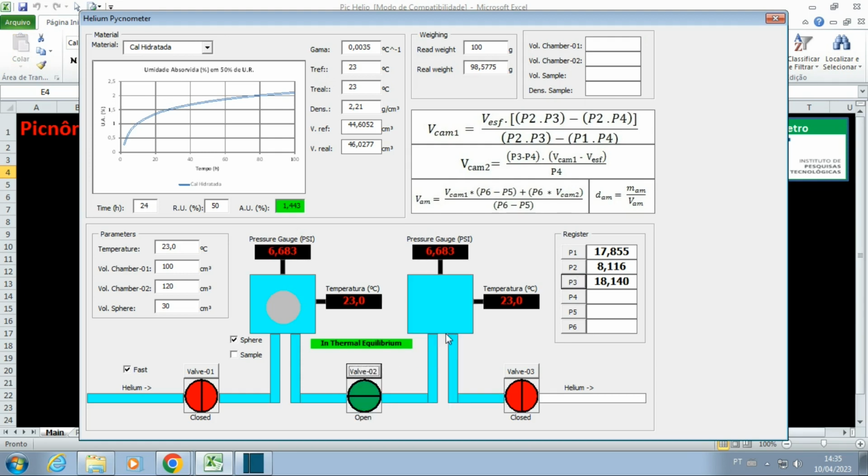We now have a linear system of two equations with two unknowns. As the number of equations is equal to the number of unknowns, it is possible to solve.